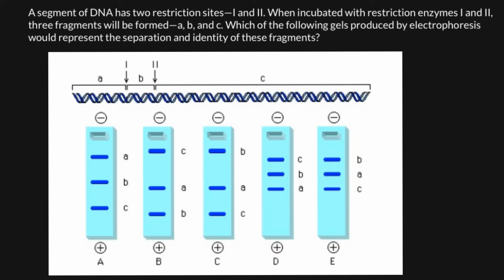Just like imagine three people with different weight. One would be overweight, another would be medium weight, and the third one would be lightweight. If they would run, after 1 minute, we would expect that the guy who would be overweight would travel the shortest distance, and the guy, for example, that is going to be lightest would travel the greatest distance.